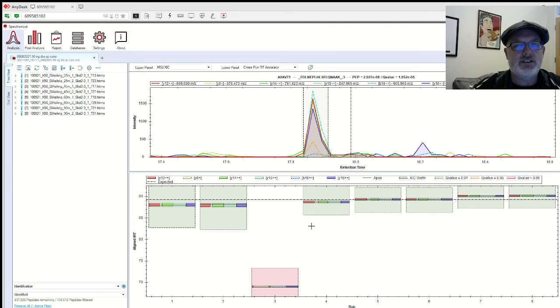Because of the iRT space and the ability to warp peptides across different gradients, it knows exactly. So it'll elute at a 25-minute gradient at a certain time. That should be a lot different if you have a 45-minute, 60, or 90, right? Because it may elute at 5 minutes here. If you have a 45-minute run, it may elute at 15 minutes. At a 60-minute run, it should elute at maybe 20, 50, I don't know. And then a 90-minute run, maybe it elutes at 75, I don't know. But because it's all translated into iRT space and mapped together, you can map them across different gradients.